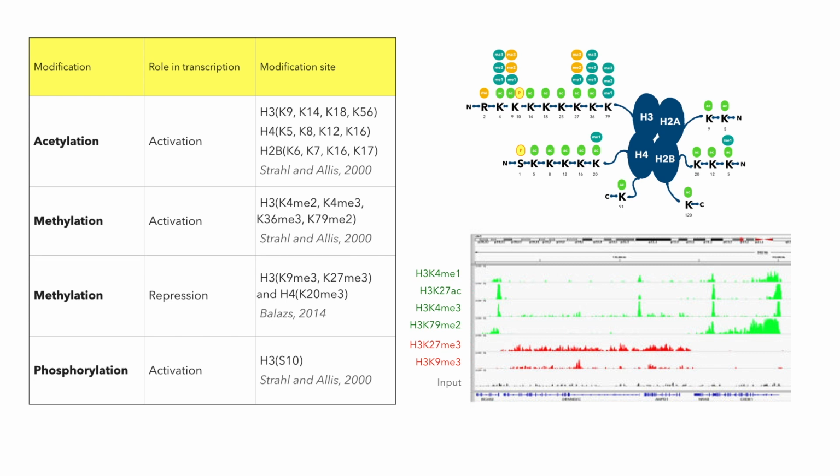Different signals act as different regulatory mechanisms and sometimes work together in complex patterns. The function of specific histone modifications is an active field of research, and many of these modifications are not yet known. On the right, you can see how these modifications appear in ChIP-seq data against the control sample. To understand this better, let's discuss chromatin immunoprecipitation for studying histone modification.